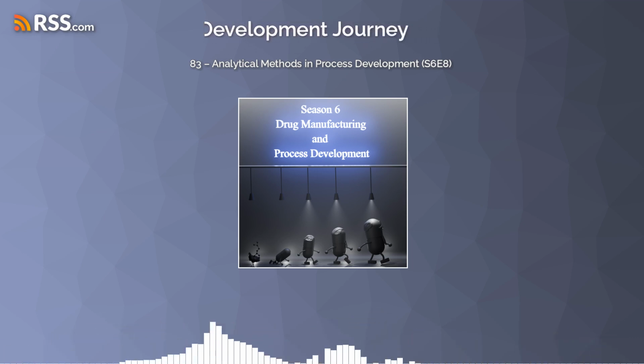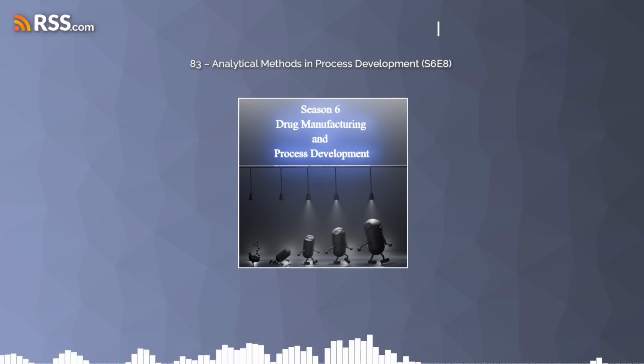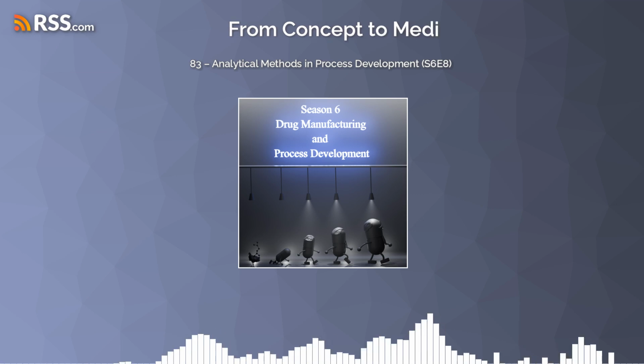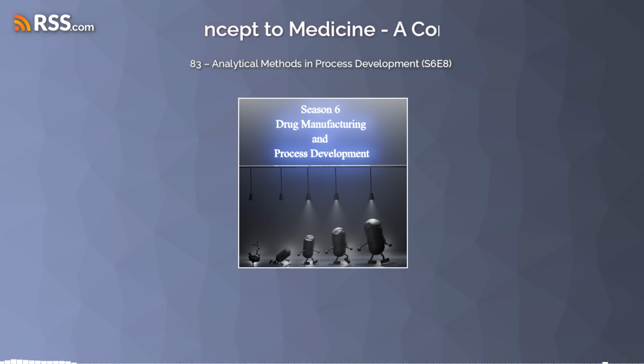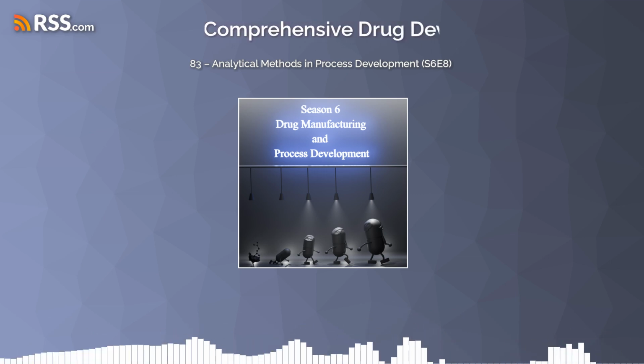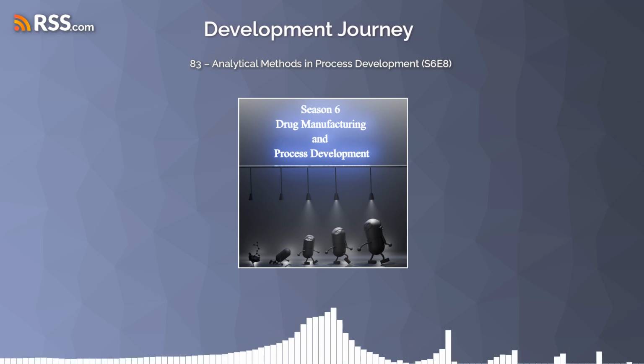So HPLC and GC, which is gas chromatography, would likely have been used to quantify how much of that desired nitrile was being made, and also to detect any palladium impurities that might have been left over. Because you don't want any of that metal catalyst ending up in your drug. It's really important to remove those.